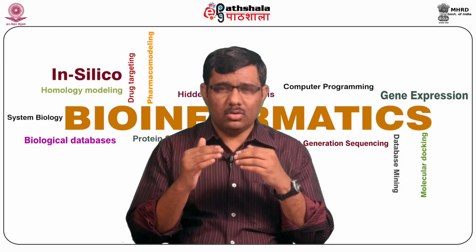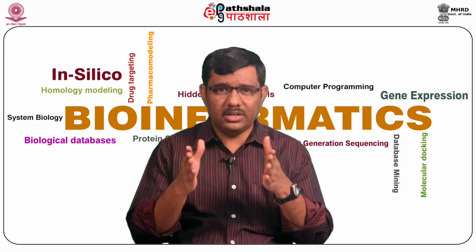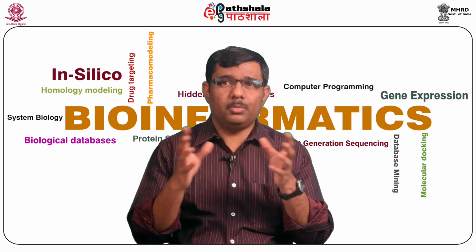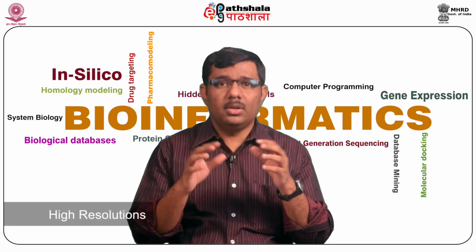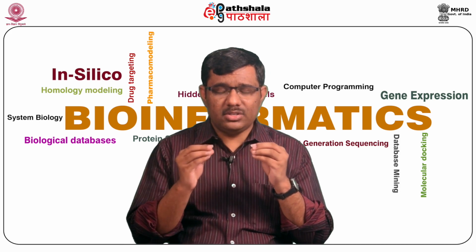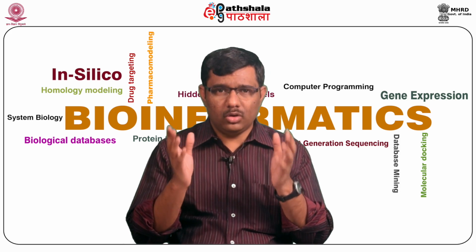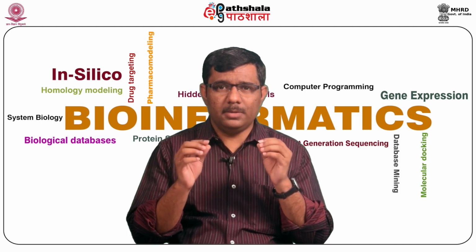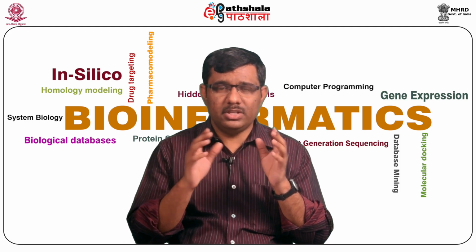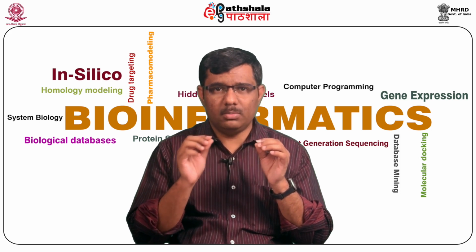These rotamer angles are generated in a library. Rotamer libraries are collected by selecting unrelated, higher resolution protein structures, because we are interested in the dihedral angles for the amino acids, not in the protein structure itself. So you get rotamer libraries with different angles from the higher resolution structures. You create the rotamer library on the condition that the backbone conformations, where the phi psi angles are within a 10 degree difference. These are called a backbone dependent rotamer library.